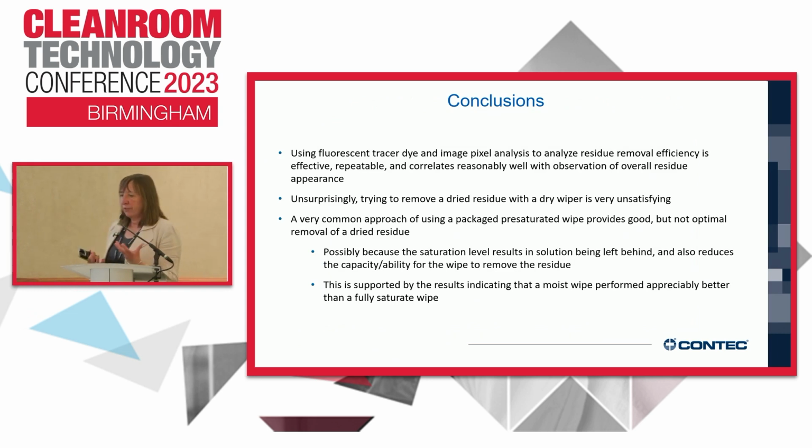So using the fluorescence and tracer dye, we managed to get a slightly more quantitative view of what was going on. But this is just a start, and we're going to do a lot more work to see if we can improve it and get to a truly quantifiable method and process.